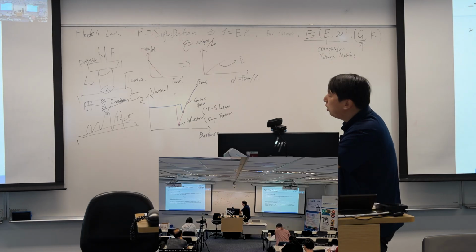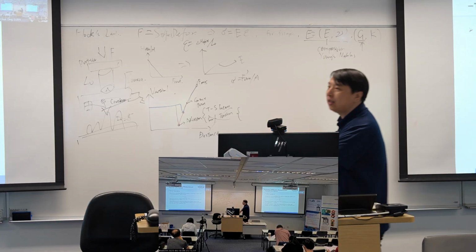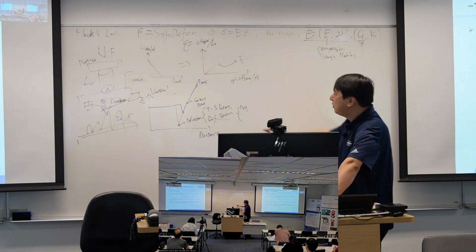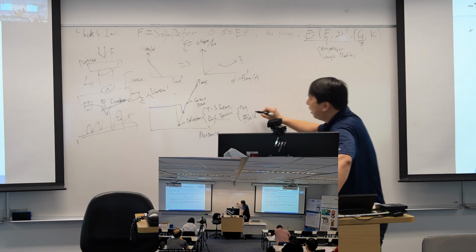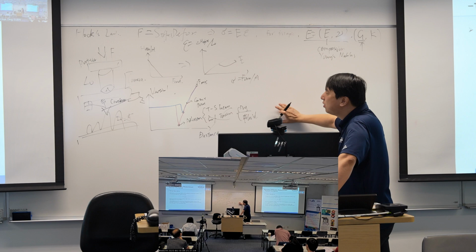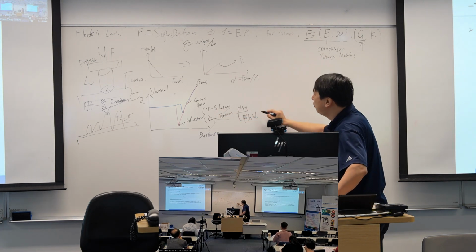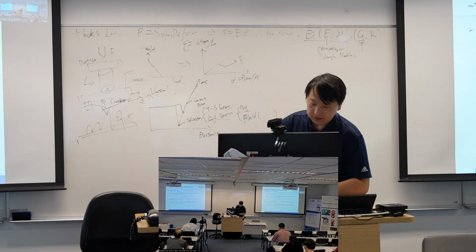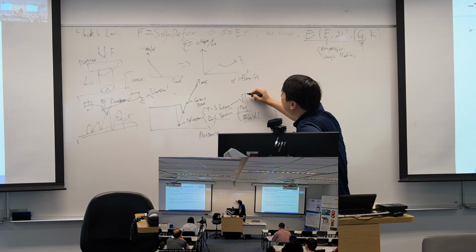And we don't want surface tension. So we have two methods to get rid of surface tension. One is super dry. One is completely fluid. And completely dry is actually very hard to obtain. So usually when we want to measure the tip-sample interaction, we need to use a fluid environment. And this tip-sample interaction is widely used in chemistry and biology.